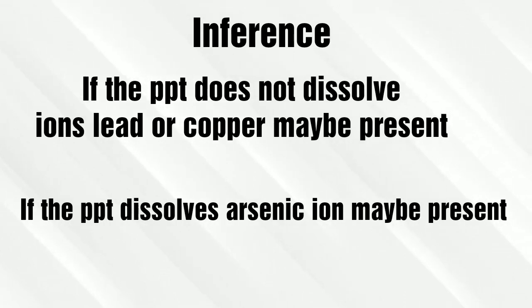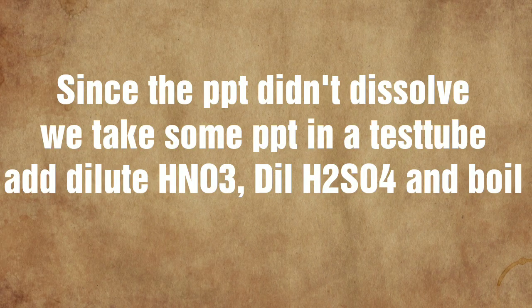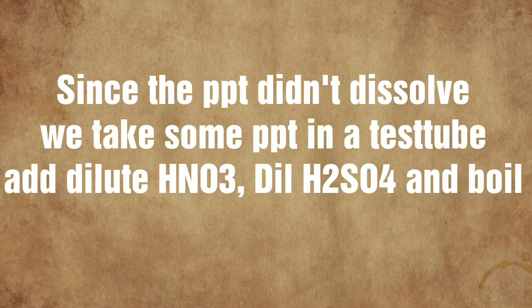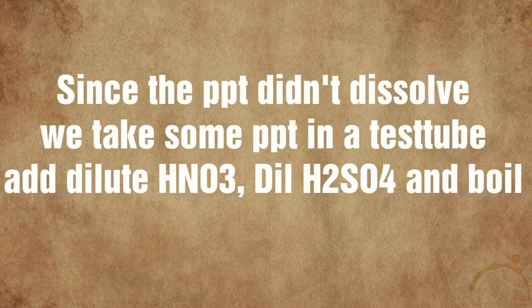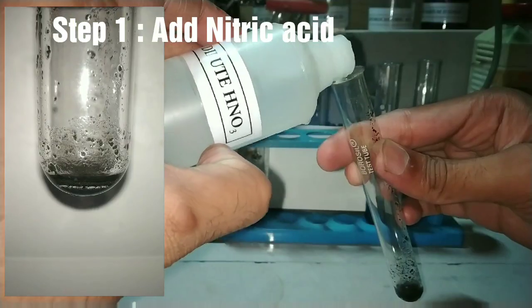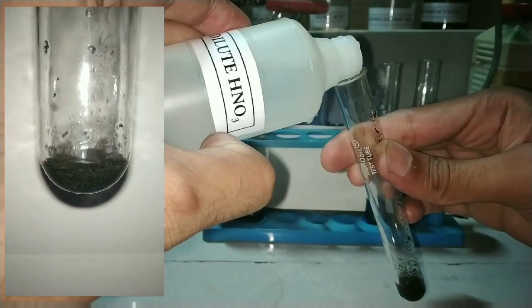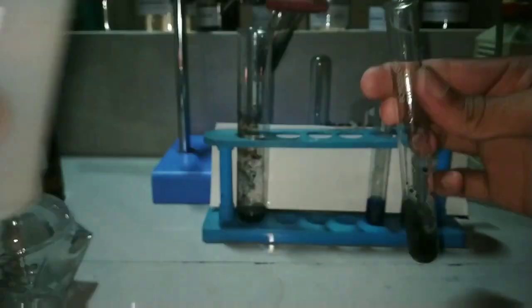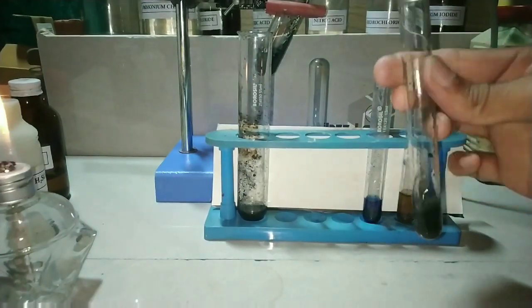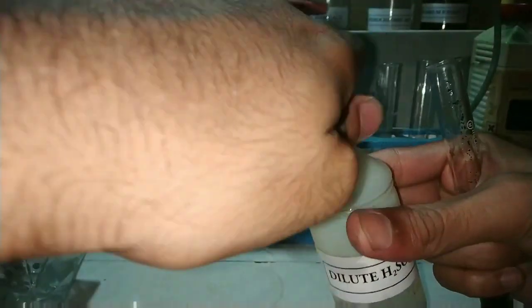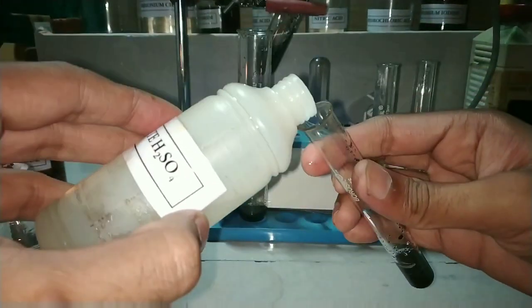But if the precipitate dissolves then it is arsenic ions. Since the precipitate did not dissolve, we will now take some of the precipitate in a test tube and add dilute nitric acid and sulfuric acid and boil the contents. To the precipitate I am adding dilute nitric acid — it's actually a 50% solution of nitric acid — and now I will be adding dilute sulfuric acid. This step of adding dilute sulfuric acid is optional, which means that you can omit it.